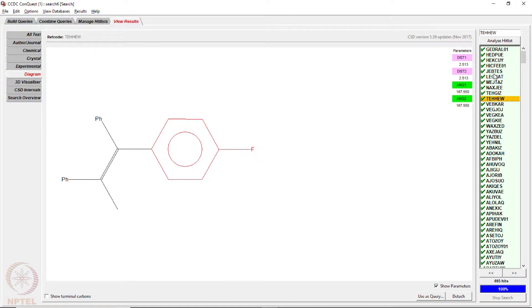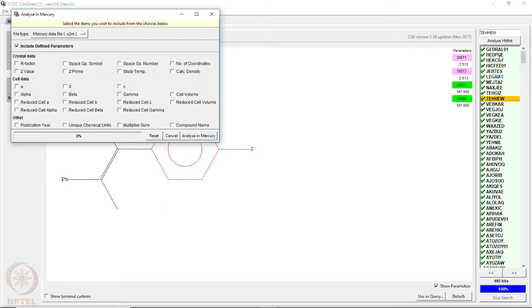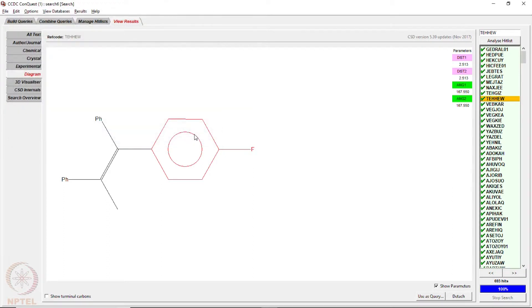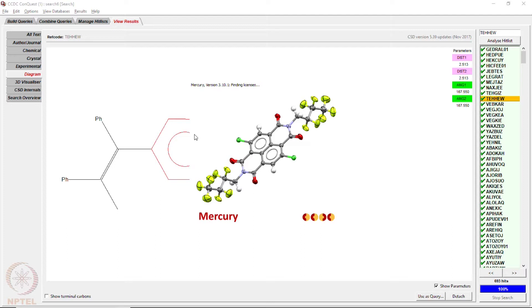Once the search is complete, one can statistically analyze this data. You can draw a histogram for distances, a scatterplot of distances, and histograms of angles. To do this, we analyze the data using Mercury. All the search results are exported to a Mercury file, and that Mercury file will then allow further analysis. You can see it is opening here — it may take a few seconds because it has to load a large amount of data.